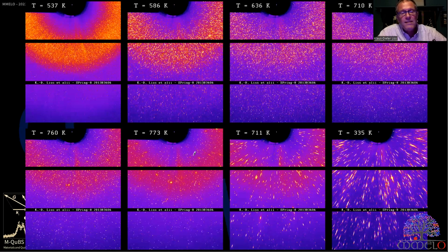And then cooling, this is the highest temperature, 773 Kelvin. And then we cool, we get these streaks. And the streaks are the reorientation strains, because we get precipitation of a second phase again, this aluminum 12 magnesium 17, and different thermal expansion coefficients giving stresses onto the grains, and therefore we get the reorientation strain.